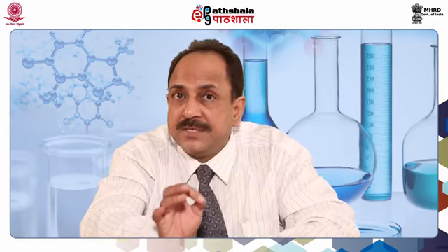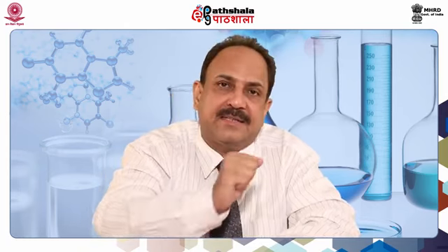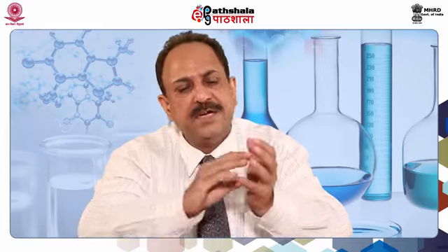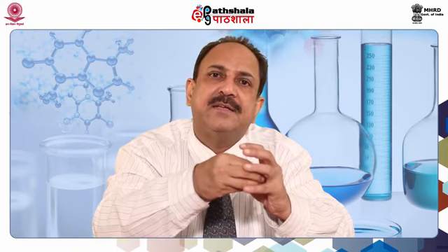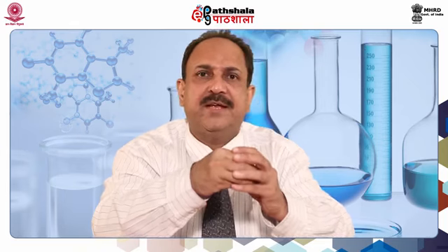The most important component of the SwissPDBViewer is to detect the binding pocket. That is, when we have any ligand bound to the three-dimensional structure, let's say it's an enzyme, and the substrate is sitting in the active site, because we can have the structure with the substrate bound to the active site.